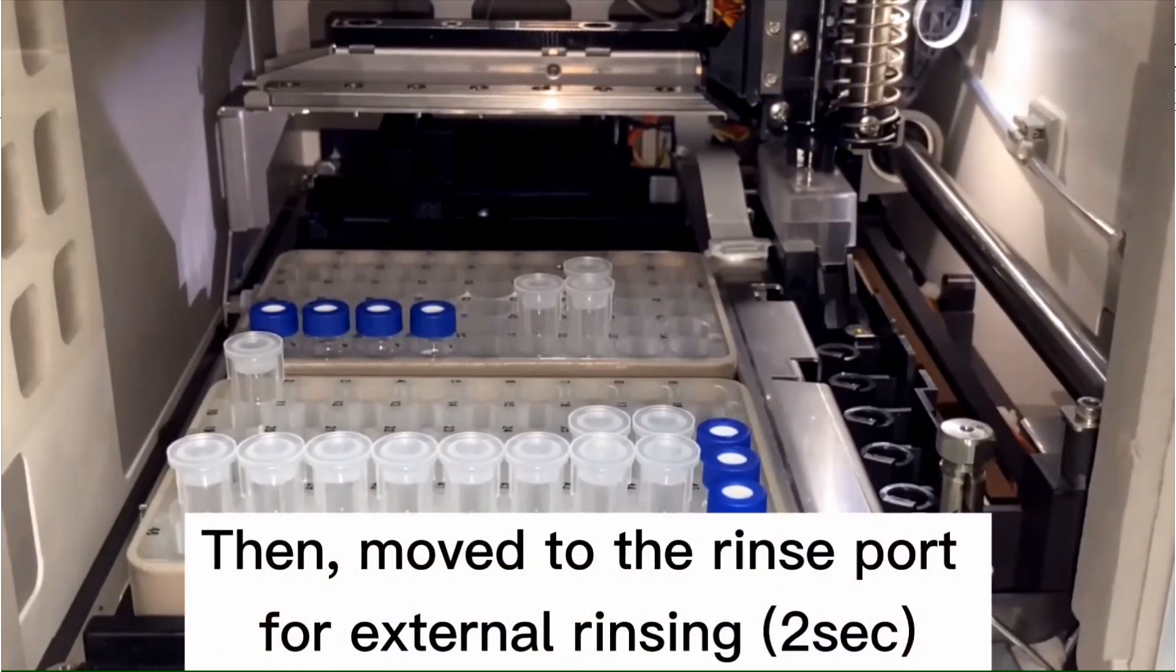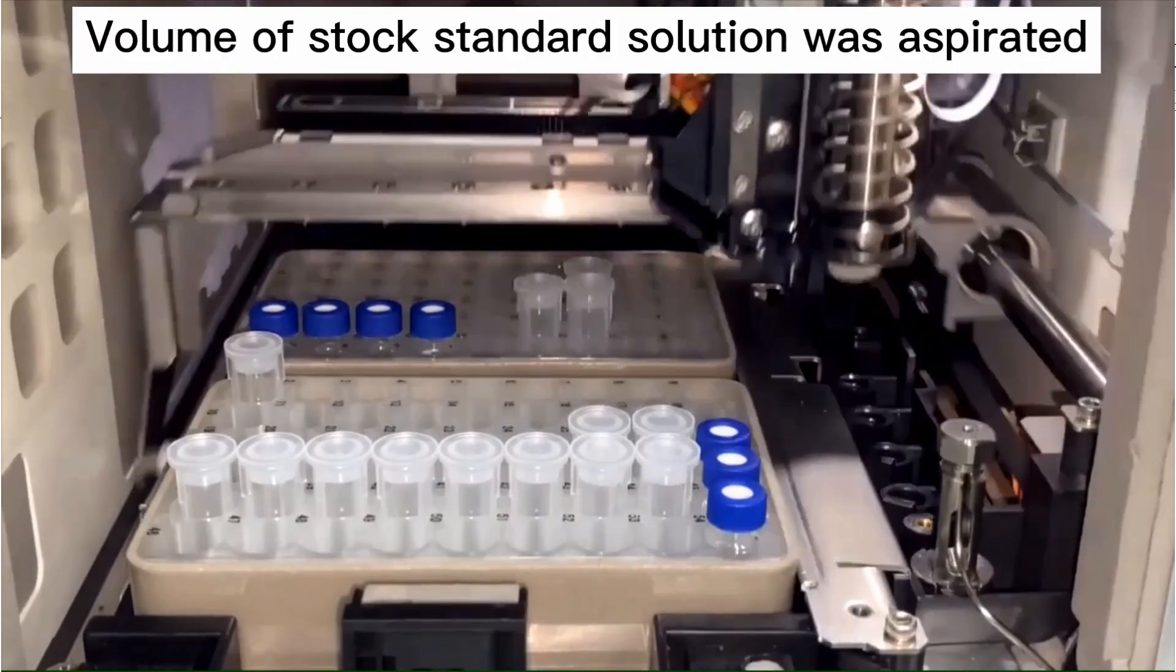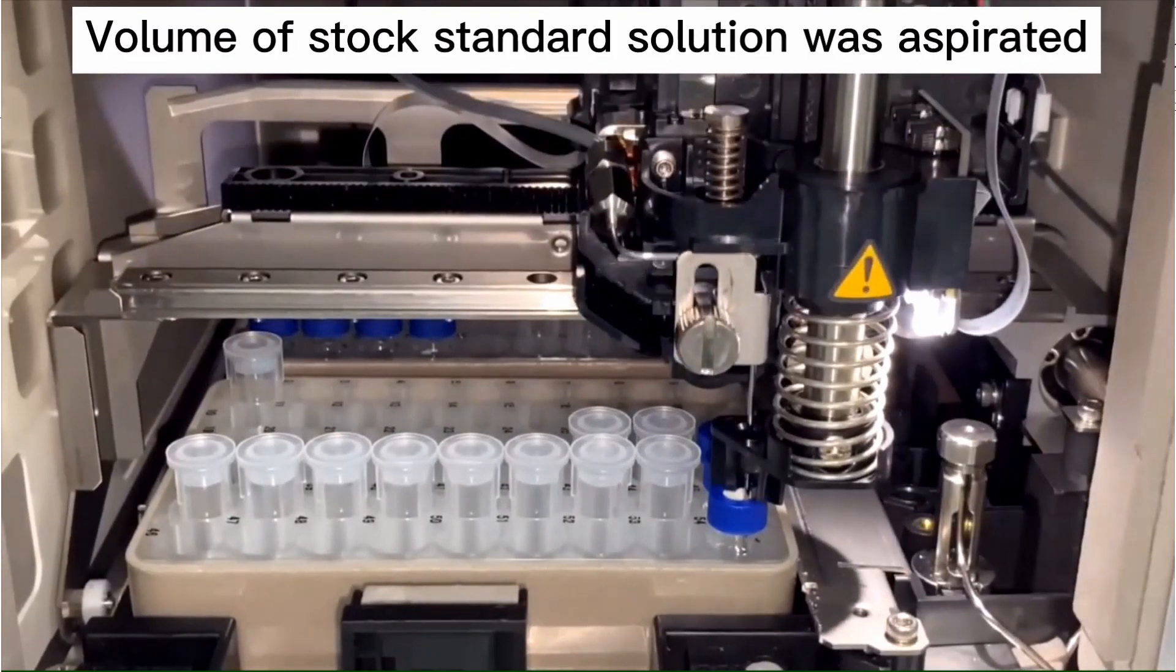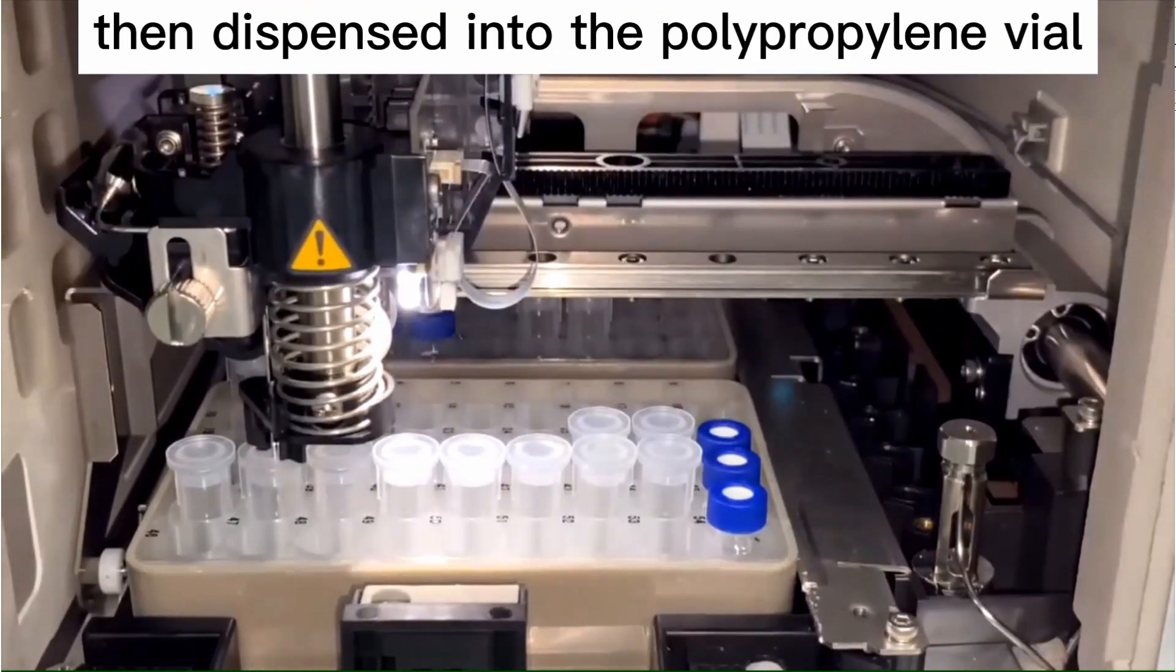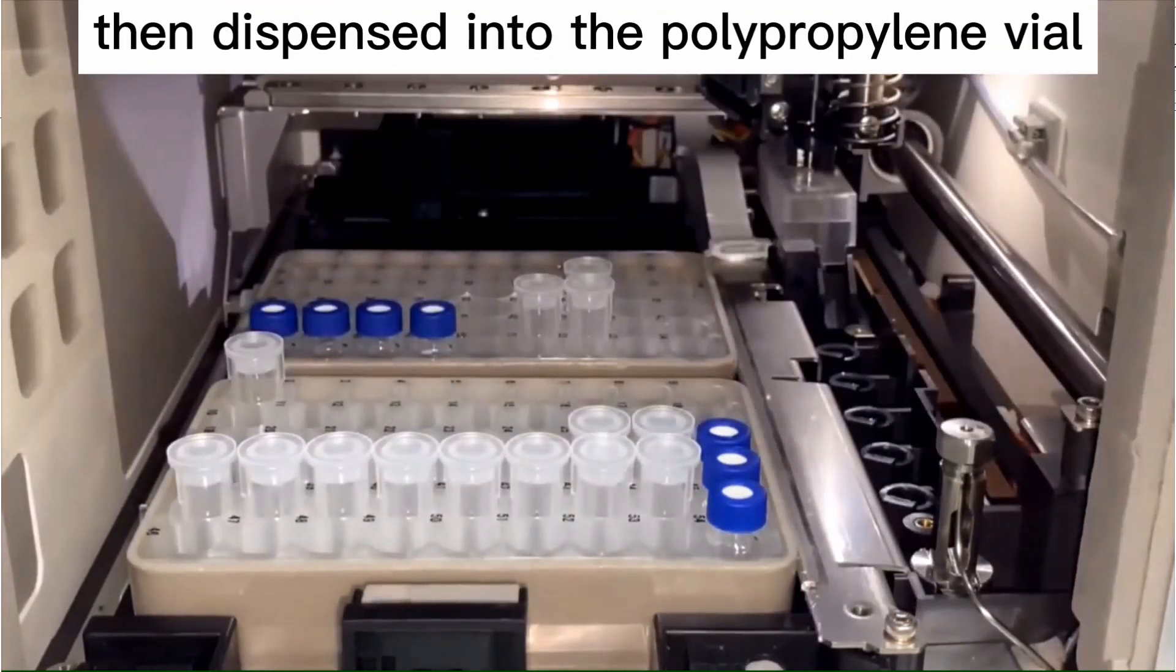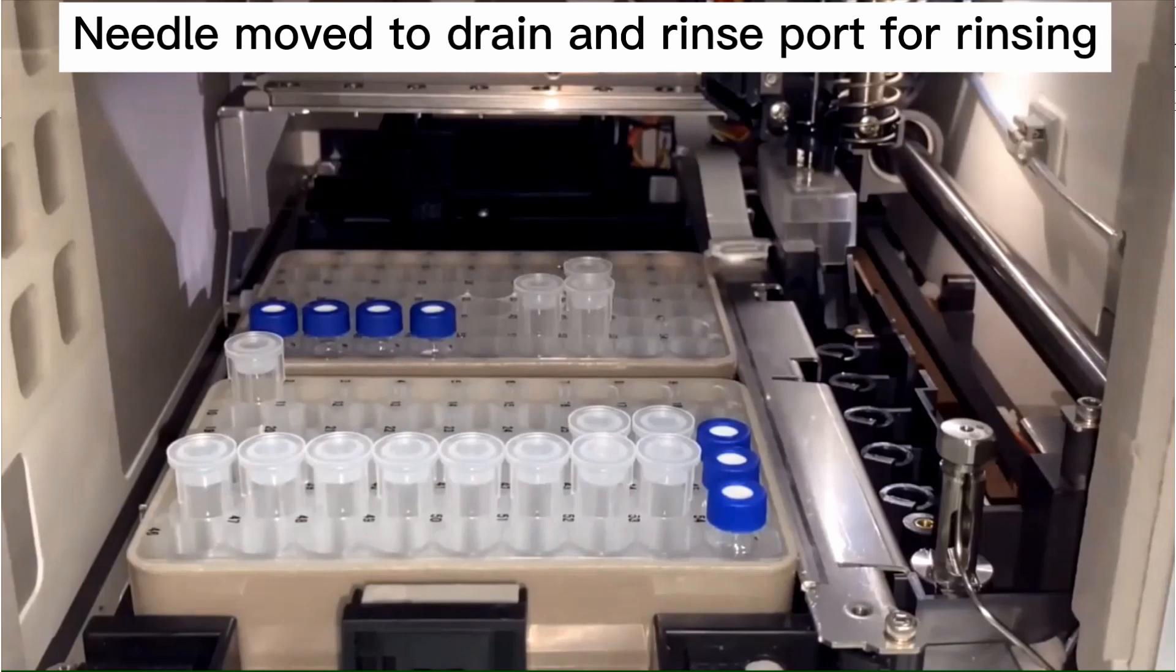Then moves to the rinse pot for external rinsing. The needle aspirates the stock standard solution and dispenses into the polypropylene vial. The needle moves to the drain and rinse pot for rinsing.